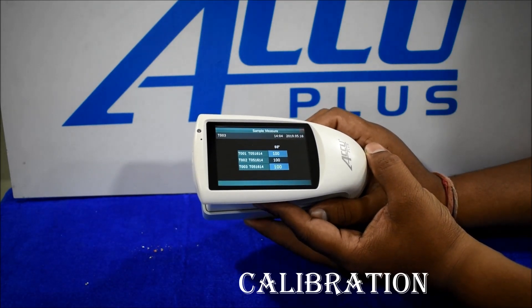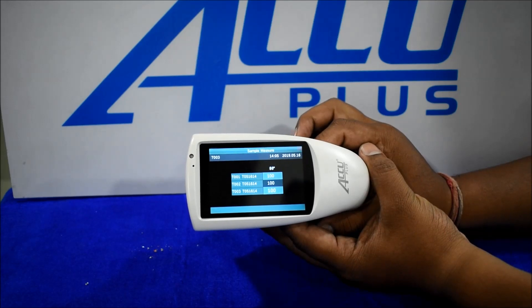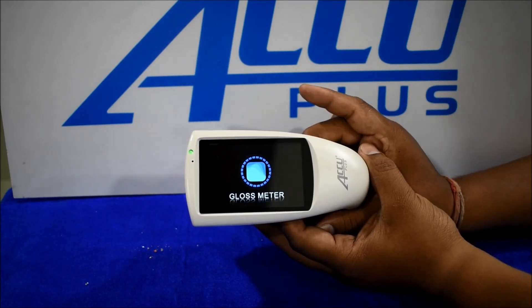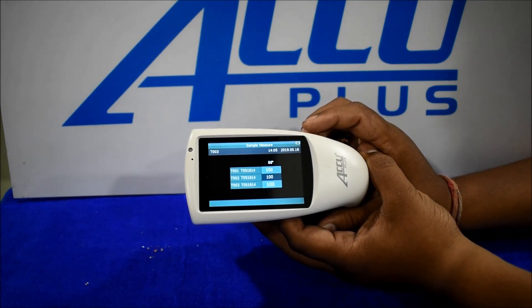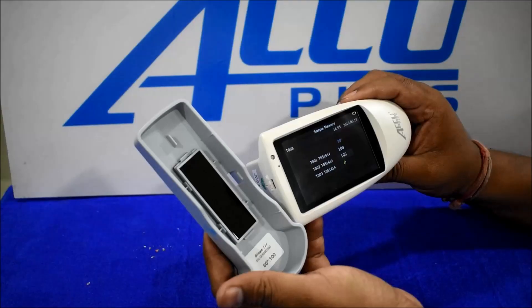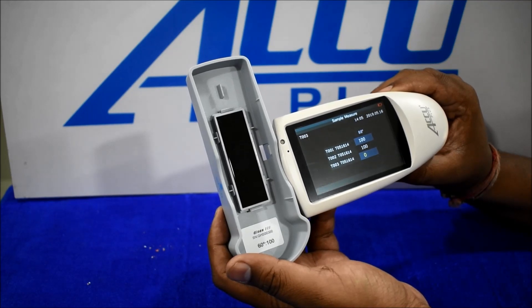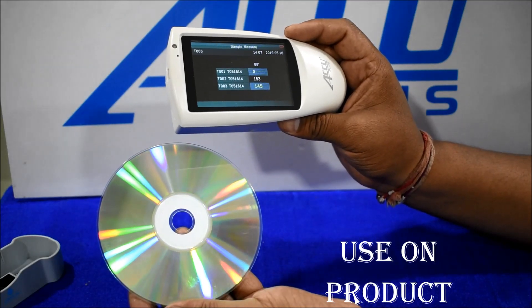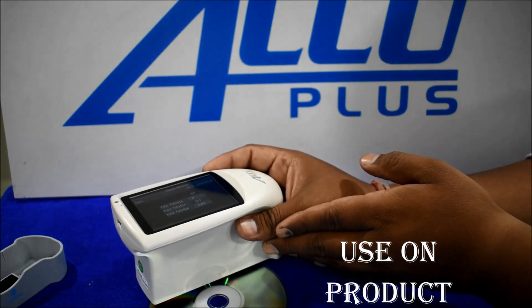Otherwise, for any reading difference, totally turn off the instrument, then take a reading — we got a calibration pass message on screen. Then calibration is completed and we got a reading of 100. We can see the reading at 60 angle — 100. Then we got a reading of 100 on screen. Now, how to use: we are checking gloss on a CD.